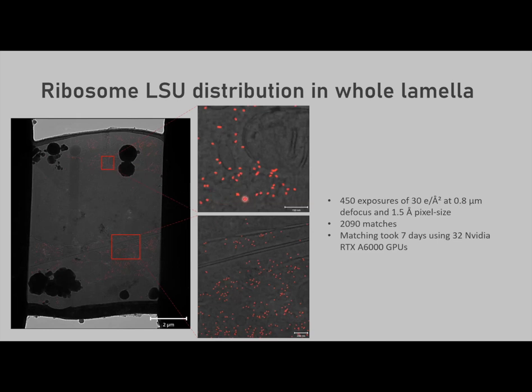And so if you zoom in, just remember every ribosome location, it's not just the location of the ribosome. We get information of its Z position and the orientation. So it's very exciting now for us to use this basically comprehensive atlas of ribosome positions and orientations to make statistical arguments of, are the ribosomes in polysomes? Are they interacting with certain organelles?